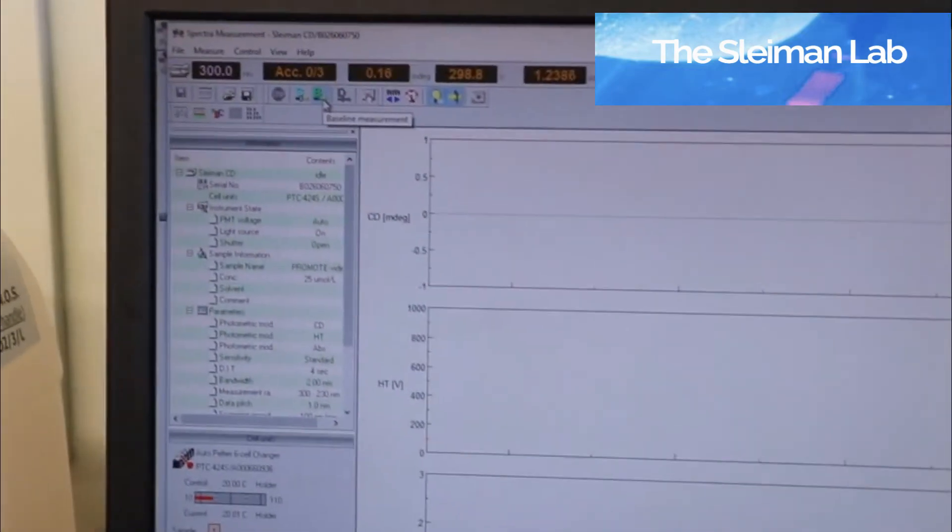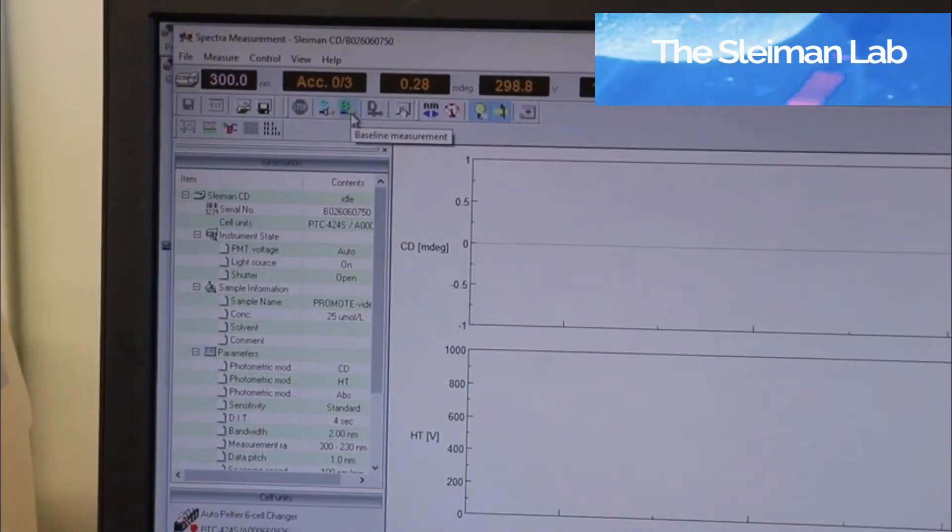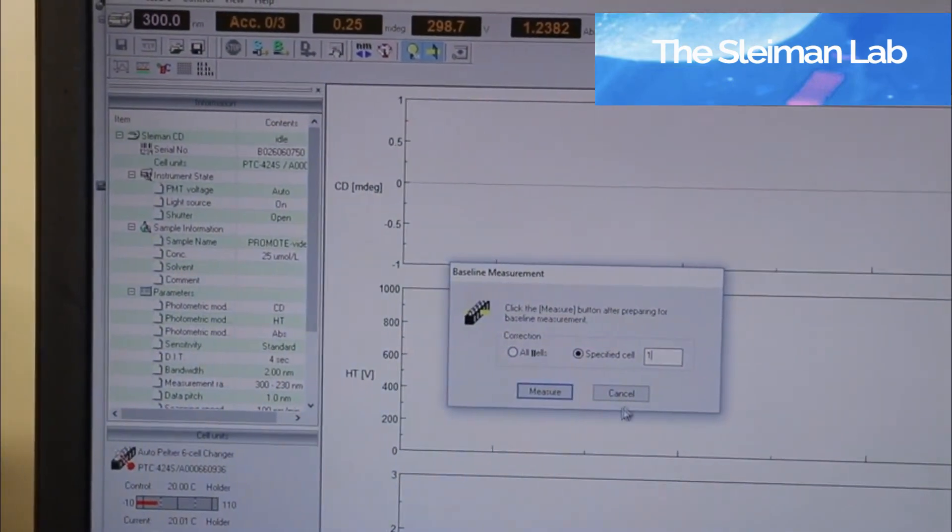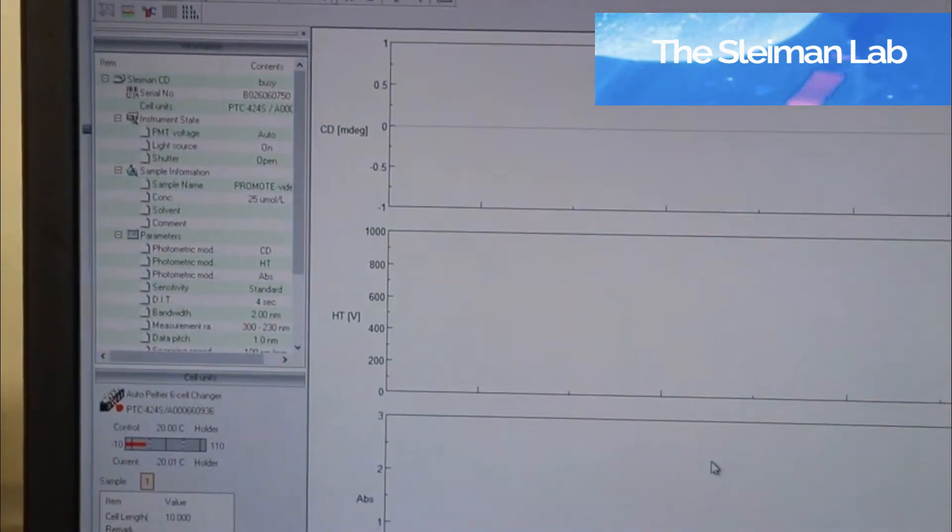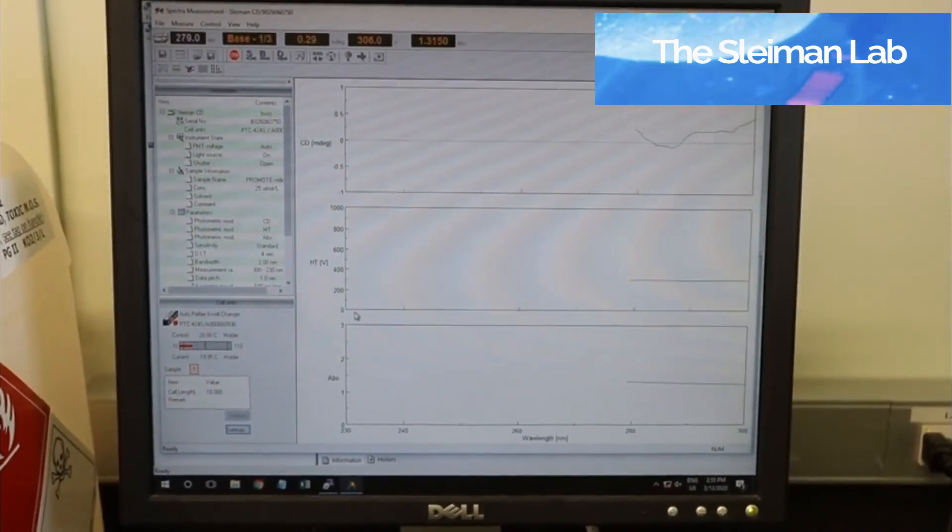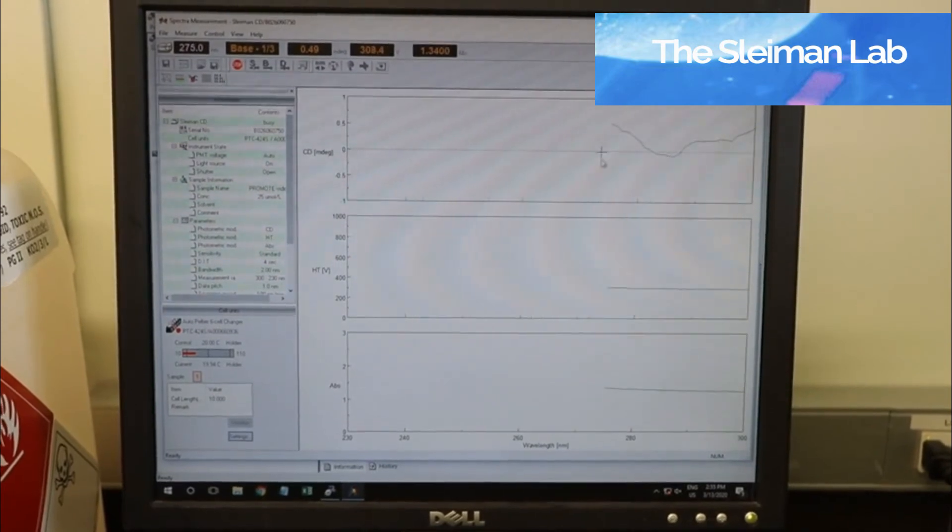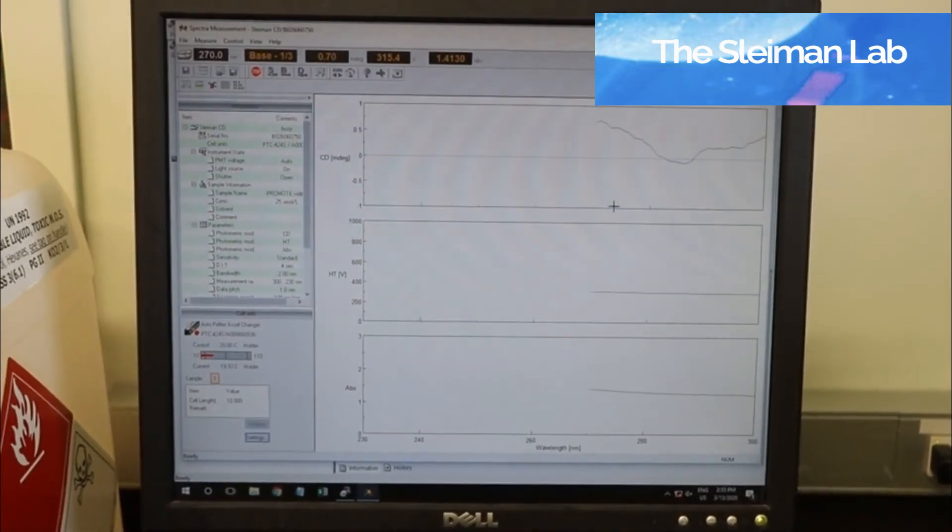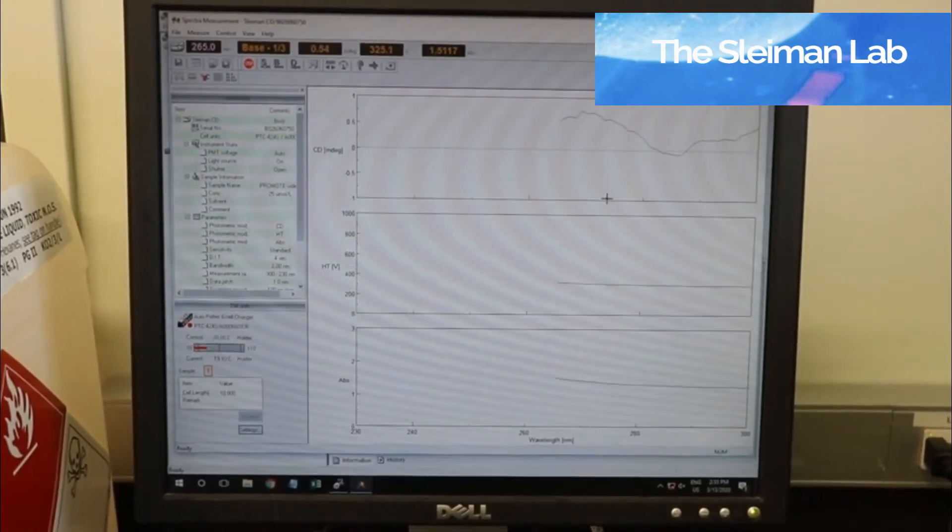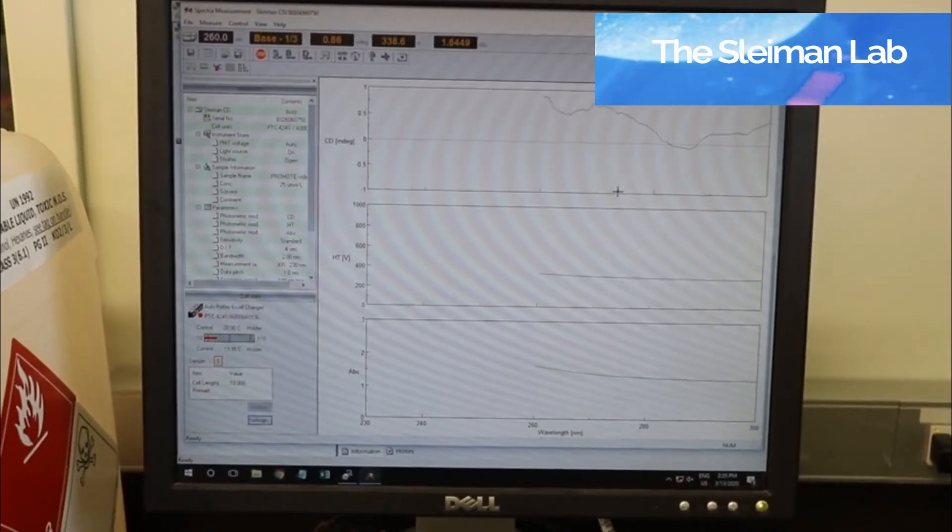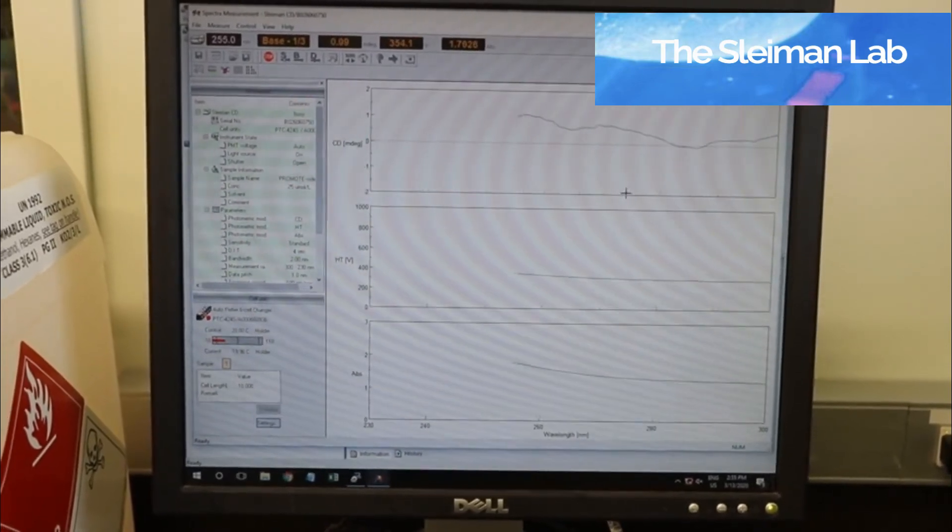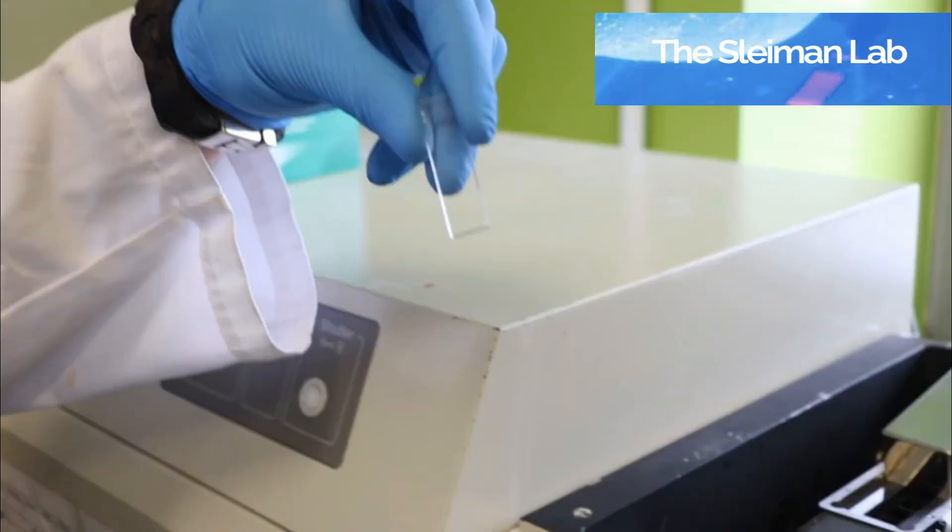The blank measurement will be the big B here, and we are running it in cell 1. We can start our measurement sequence. It is normal to see variations in the CD in the blank, depending on the quality of your lamp and how recent the instrument is. We have an old instrument to see variations of one millidegree.